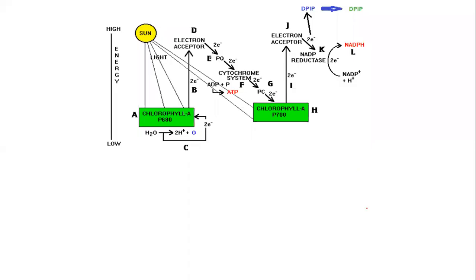Hello, everyone. This is Mr. Ventura again. We're going to take you through a photosynthesis lab for this week. What we're going to do is a special kind of chemical reaction that's going to tell you whether the light reactions of photosynthesis are actually happening or not.